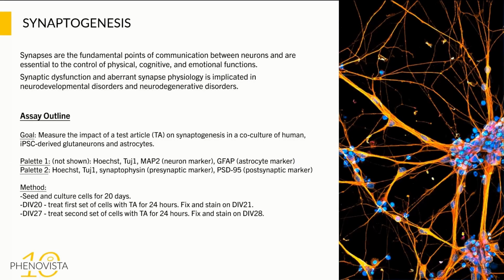The setup for this experiment: synaptogenesis takes a while. So these cells need to be cultured, typically for most vendors, at least 20, 21 days. The longer, usually the better, the more synapses you'll get, the better established these networks are.